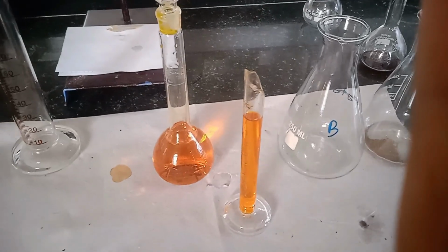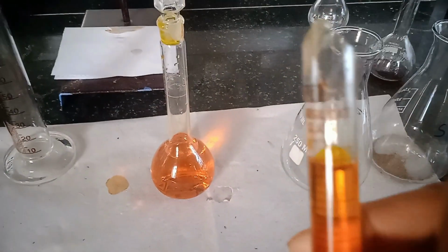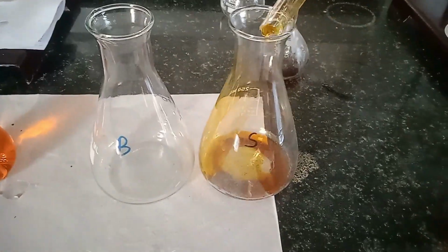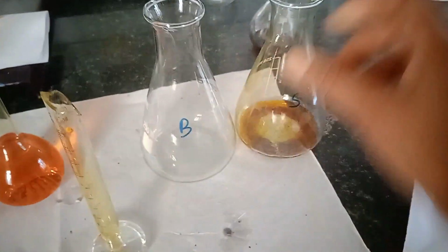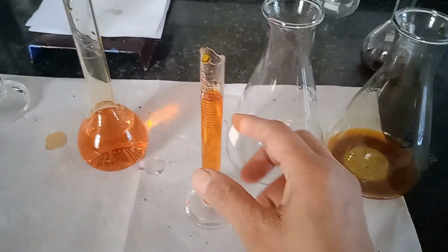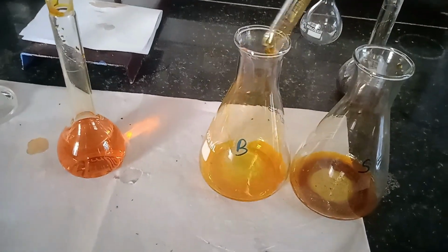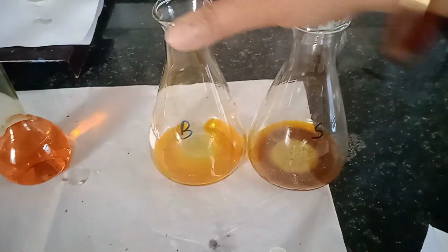To this I am going to add 10 ml of 1 normal potassium dichromate solution to this soil. Similarly, I am going to add 10 ml of potassium dichromate to the blank conical flask. Here I am going to transfer this 10 ml of 1 normal K2Cr2O7 to the blank conical flask.